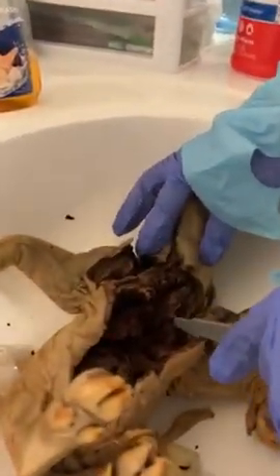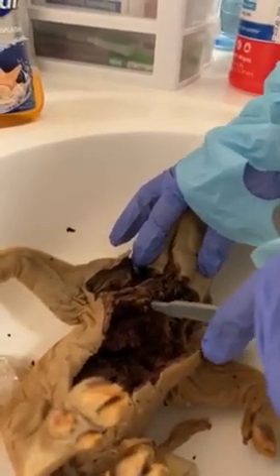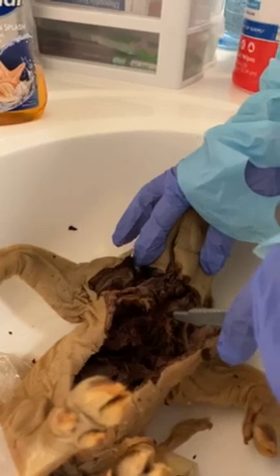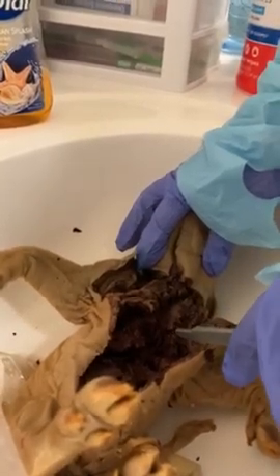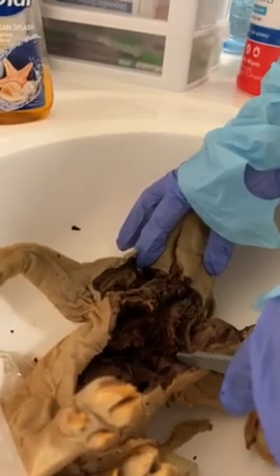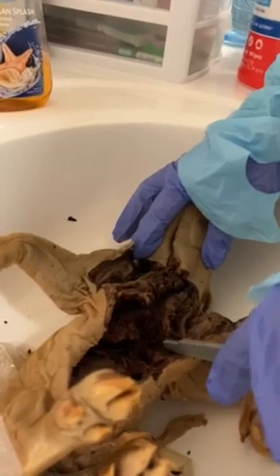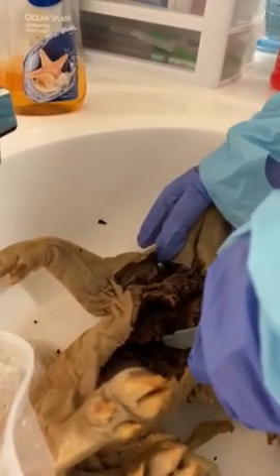The lungs are divided into three parts. The first two parts are the apical lobe. The middle part is the cardiac lobe, and the last part is the diaphragmatic lobe. And it also has a last lobe that is called the intermediate lobe.